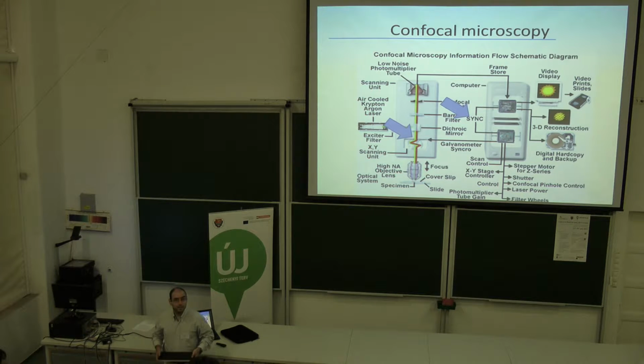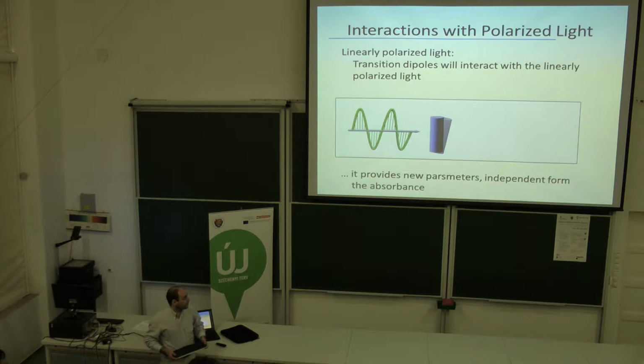It will be important for the DPLSM as well. Why build DPLSMs? It's very important and useful to gather more information about a sample than just absorption. The interaction with polarized light contains more structural information in the background. We would like to gather that information as well.